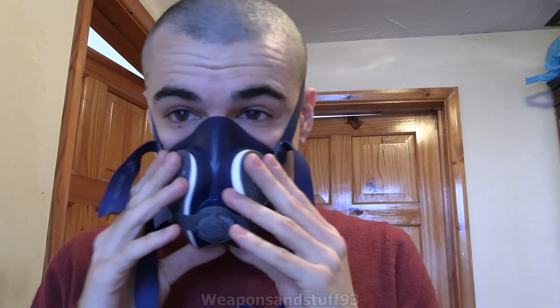That's all there is to putting these on properly. With some of these you can do a fit check by either covering the intakes or outtakes and breathing in or out. I can feel a bit of pressure building there — I can feel the mask inflating. So that's fine. That's the GVS Ellipse, and there'll be lots of other masks with a similar design.